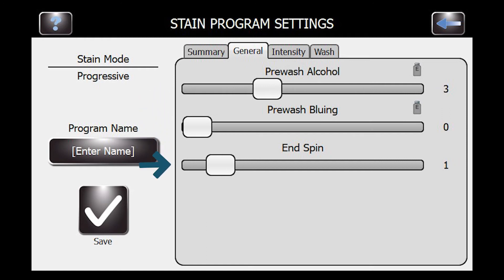End spin is an option — one of the big differences on this machine is that we end with the slides wet. We give users the option to have end spin so they can spin the carousel enough to get the staining liquid off, clear the slides a little bit, and make them easier to handle. Most defaults come at one or two. You can turn it off completely to keep slides as wet as possible. If the carousel is a little messy, you can pump the end spin up.